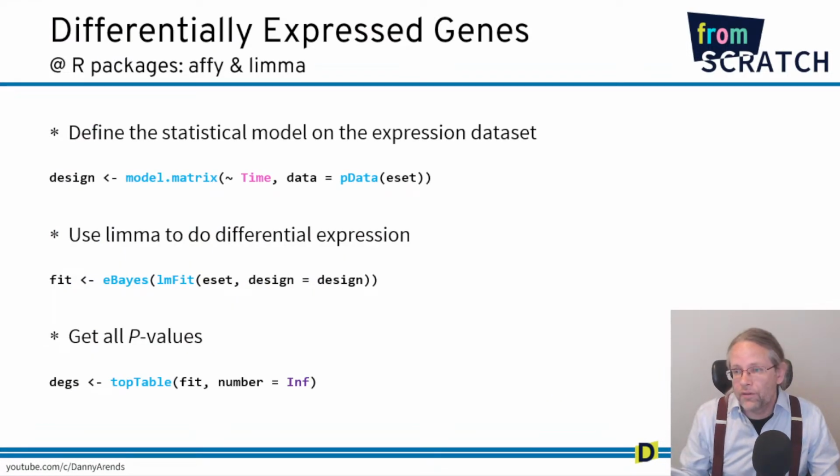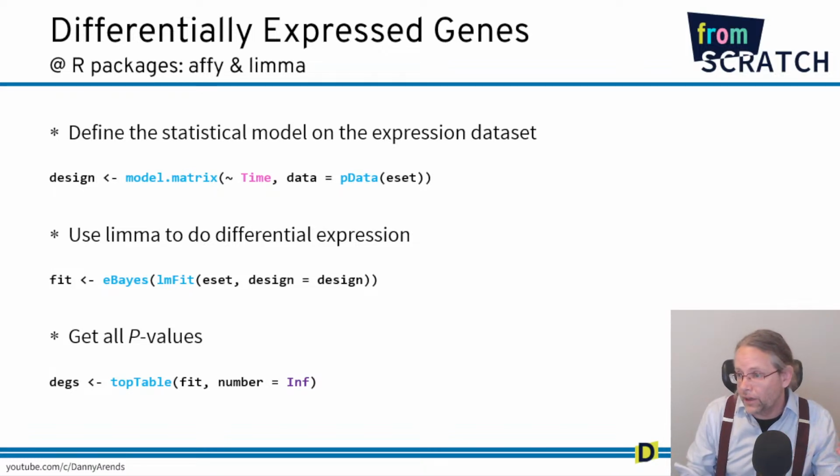So nothing fancy. This is how you would normally do a microarray experiment where you just have two groups. There's nothing really that you can do wrong when you only have two groups, because the model matrix is just simple. You could even flip the ones and the zeros, or replace ones and zeros with twos and threes, and still it would understand what you're trying to do.